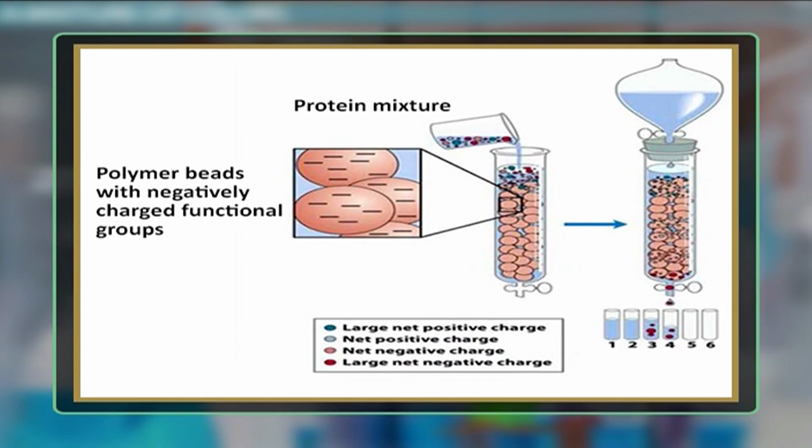This chromatography is one of the most important adsorption techniques used in the separation of peptides, proteins, nucleic acids and related biopolymers, which are charged molecules of different molecular sizes and molecular nature.